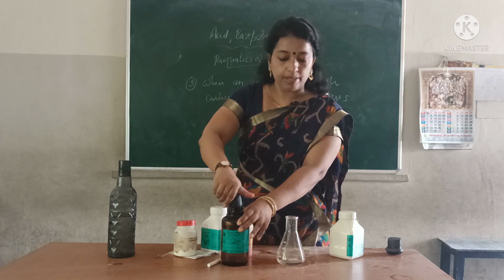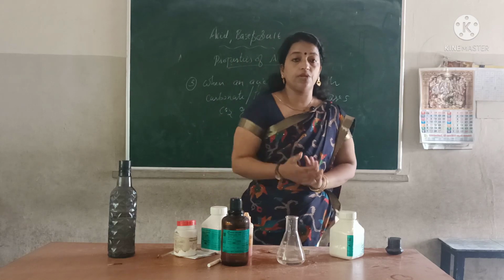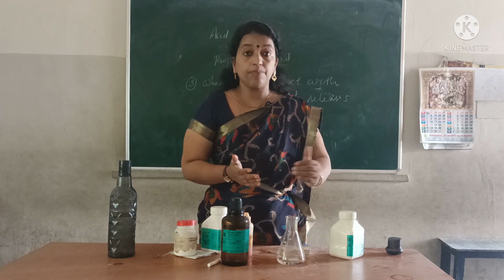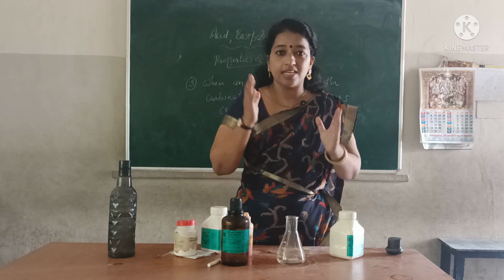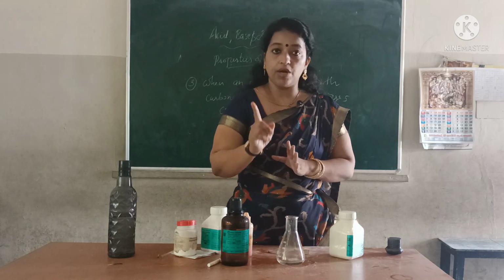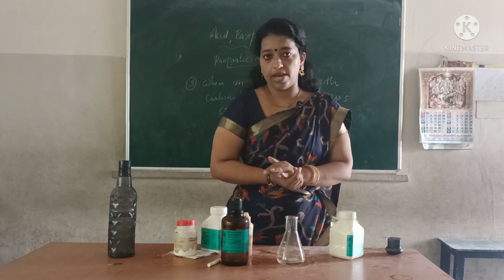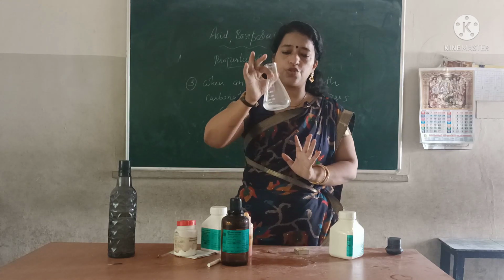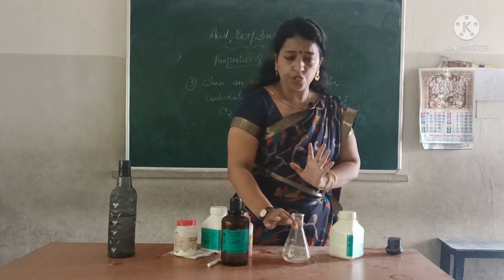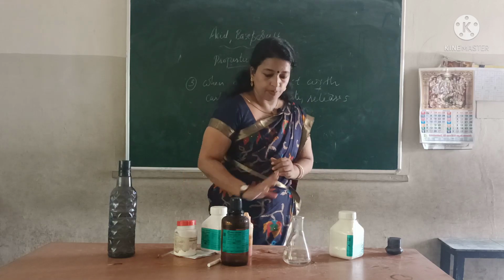Right? In the first experiment, I showed you that when I showed the burning matchstick, it put off with a pop sound. Here we cannot hear any such sound. It simply puts off. Then the coming out gas is which gas? Carbon dioxide gas. Right? So this is a simple experiment to show you the idea. But in your textbook, something different is given, which I will explain now.